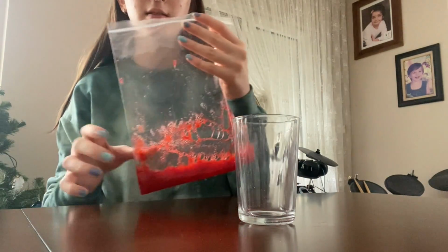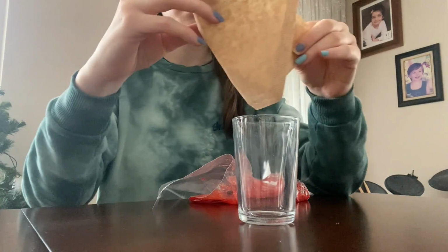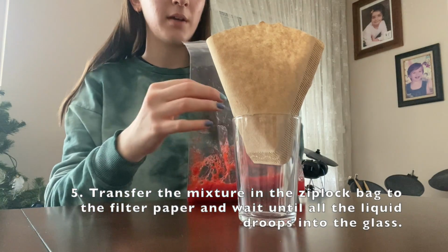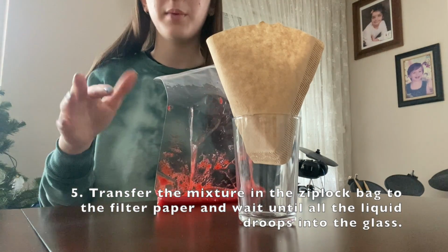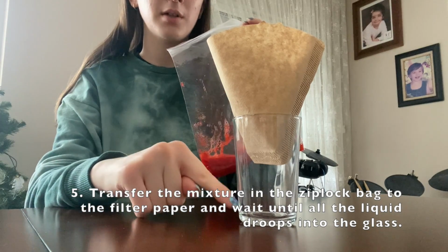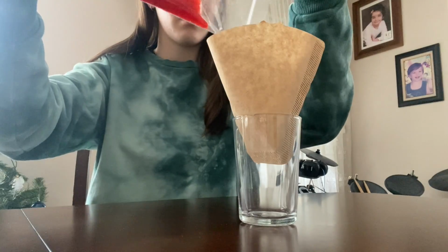Once you have mixed the strawberries and the solution, the next step is putting the coffee paper filter on a cup and pouring the strawberries in and waiting about 5 minutes until all the liquid drops through the paper to the glass.